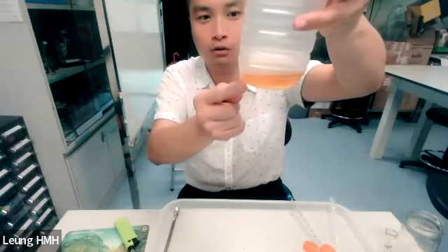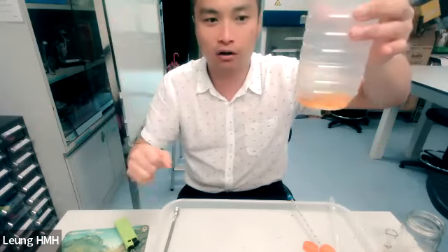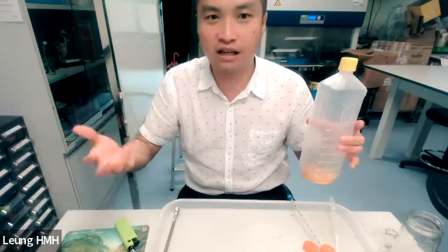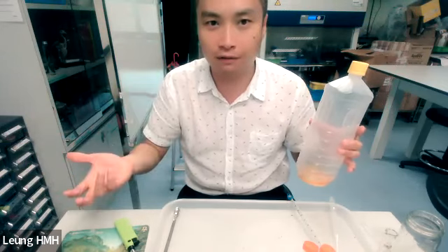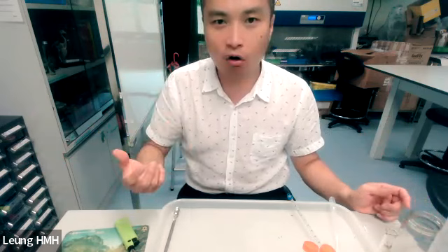And also we try to separate biodiesel from the mixture, right? This is what we need to do for the biodiesel to be used commercially, or in our real life, right? So okay, I will repeat the experimental procedure.